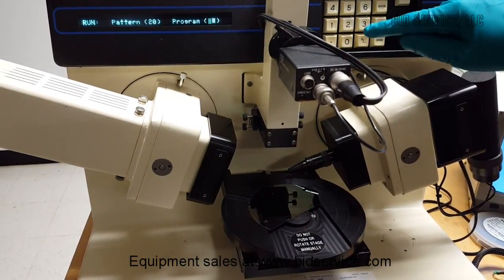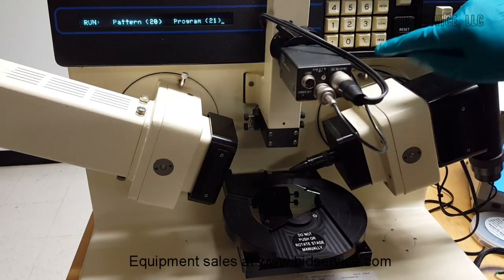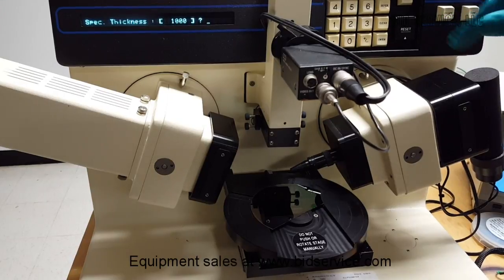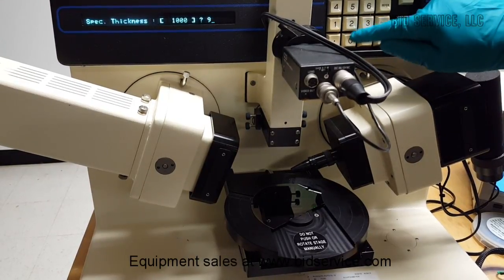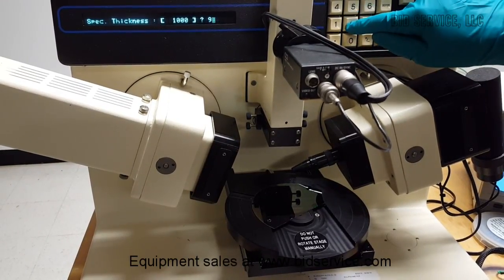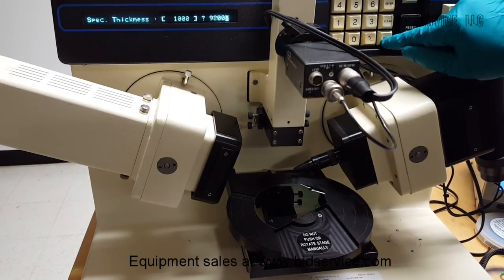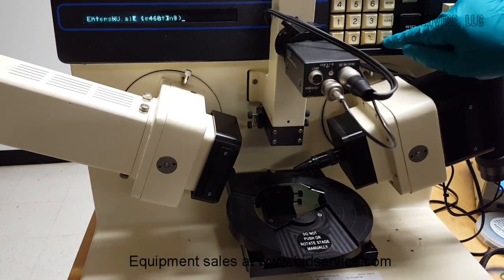This time I'm going to only measure once, and the specified thickness 1000, I'm going to enter as 9200. Enter.